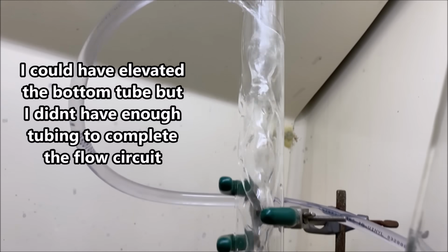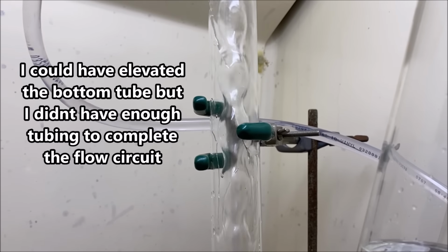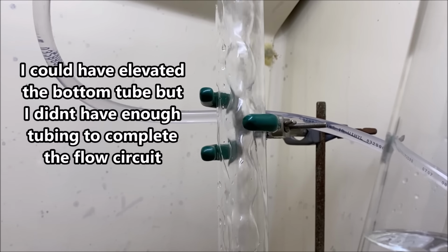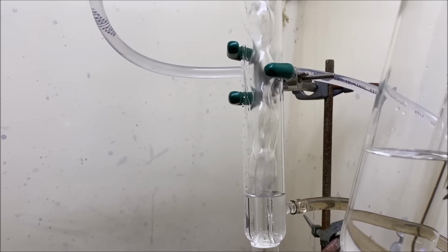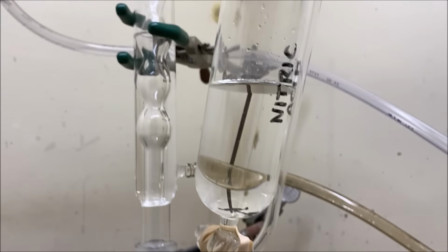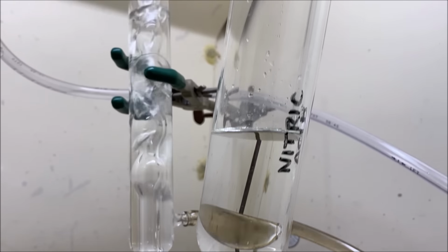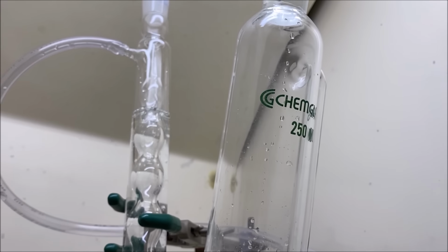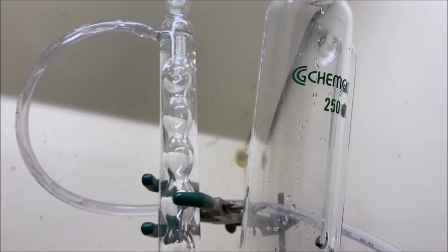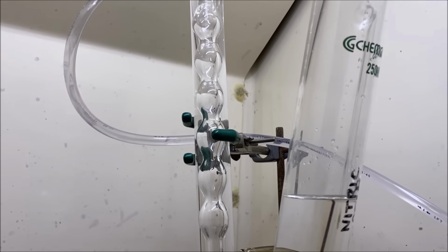Okay, that flow is not gonna work. As you can see, the condenser is left bare inside where I need to have water surrounding the inner tube. So I'm gonna have to reverse these hoses. I reversed the hoses. I'm gonna turn this on now. And we're gonna be feeding it in from the bottom to the top. There you can see, that's what we need. We need the inner tube in that condenser flooded in order for our reflux to work properly.